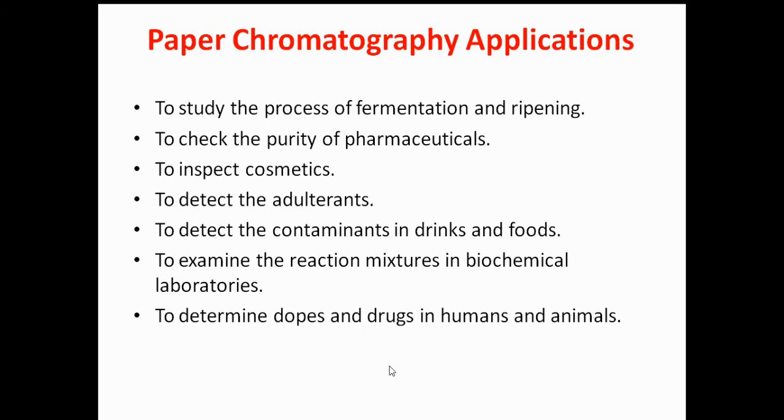So this is all about today's class. We have seen what paper chromatography is, what the principle involved in it is, what steps we have to go through to conduct paper chromatography, and the different modes of development and the applications.